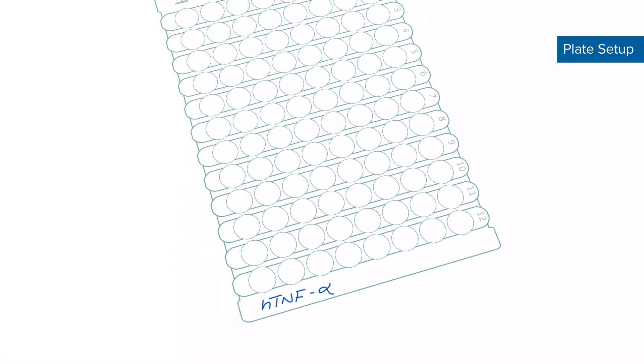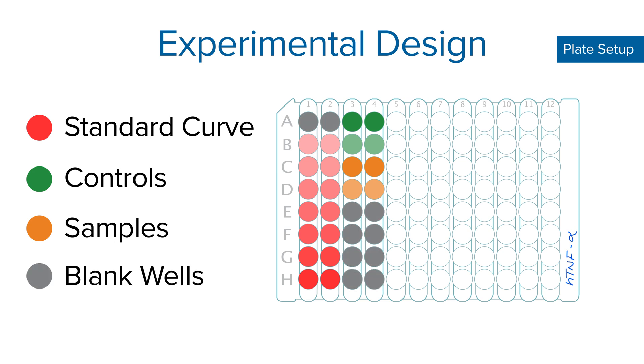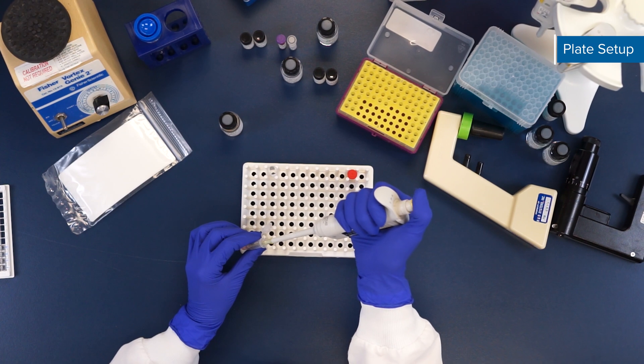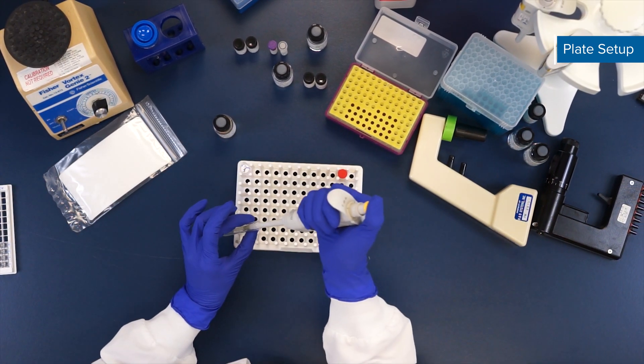In our plate, the standard curve will be set up in duplicate in strips 1 and 2, and our controls and samples in duplicate in strips 3 and 4. This is also where you can consider running additional dilutions of your samples. Follow the recommended sample dilution factor in the sample preparation section of your kit booklet. If a recommended dilution is not listed, samples can be run neat. Multiple dilutions are recommended for unknown samples.